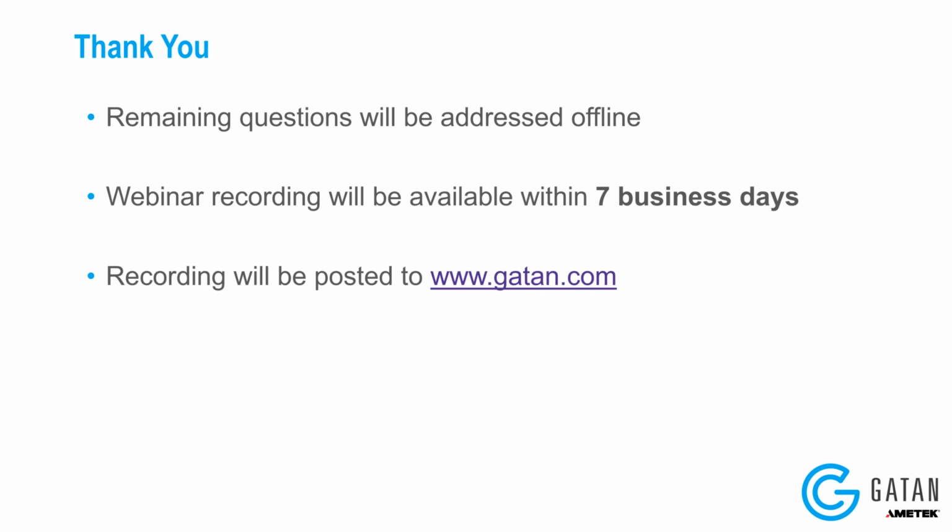And then the Stella camera is a slightly different version of a direct detection camera. It's what's called a hybrid pixel camera. Hybrid pixel cameras' main advantage is that they have huge dynamic range and really high speed, at the trade-off of a smaller image size. Typically the Stella camera in its most popular format is 512 by 512.